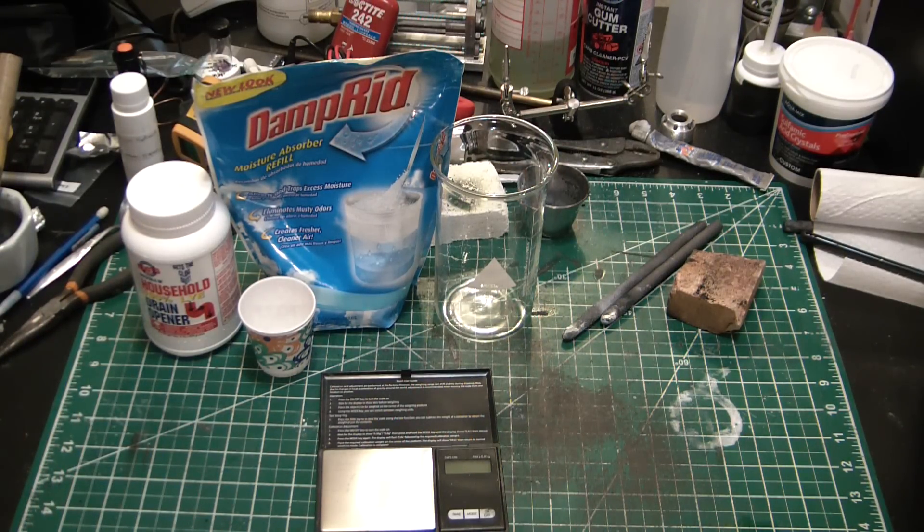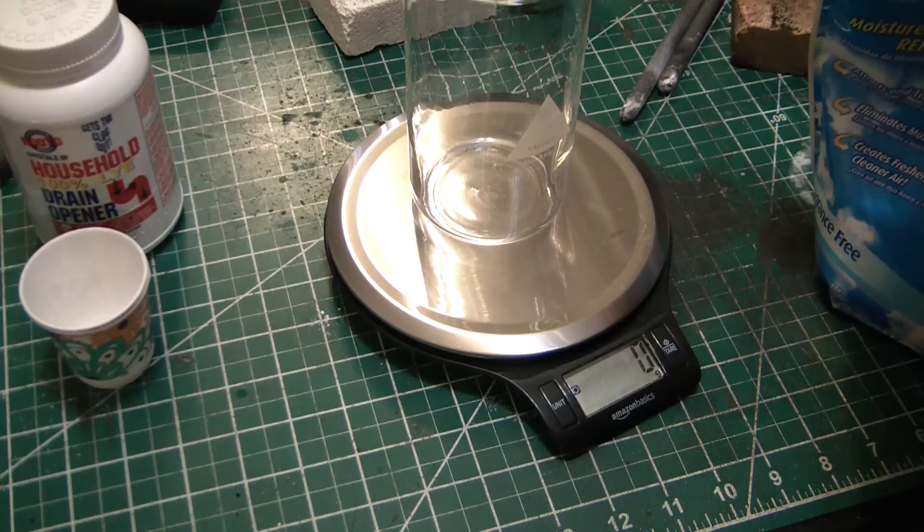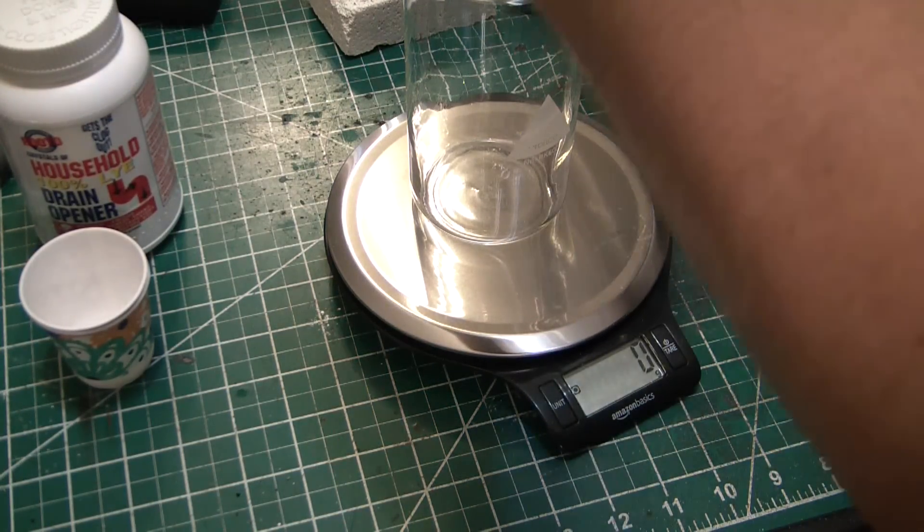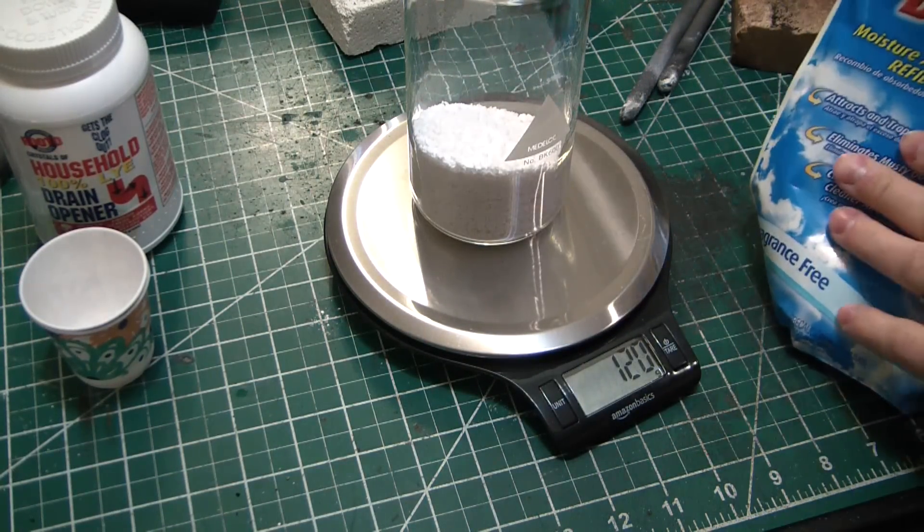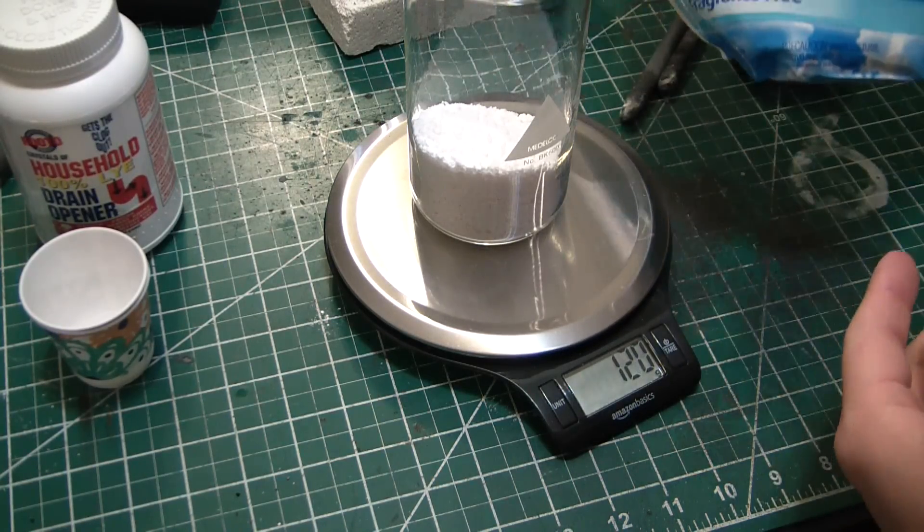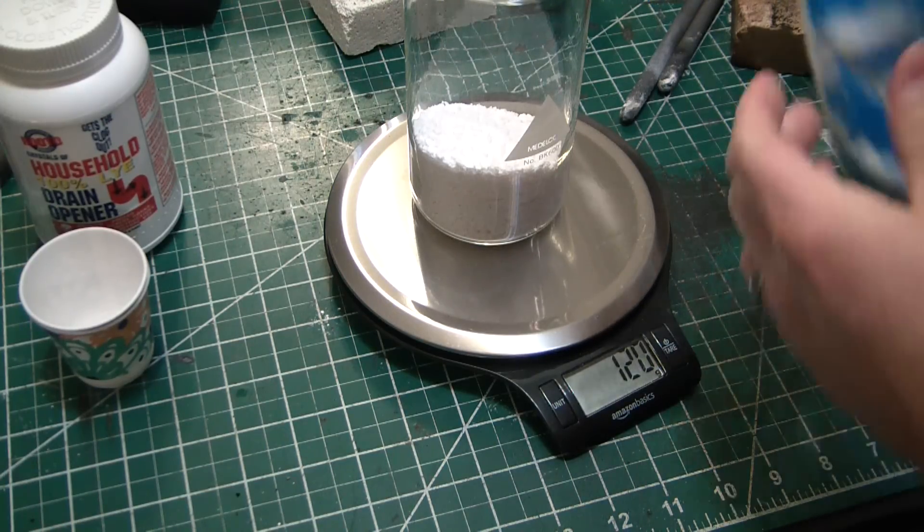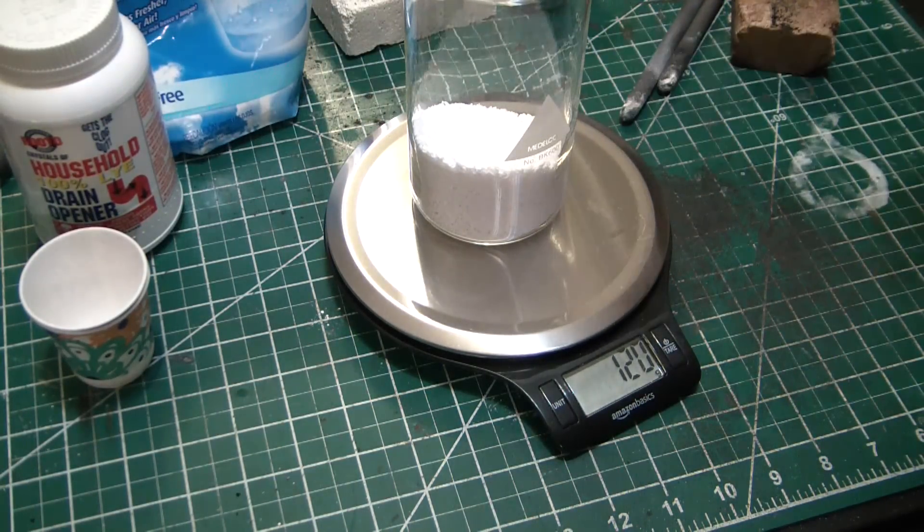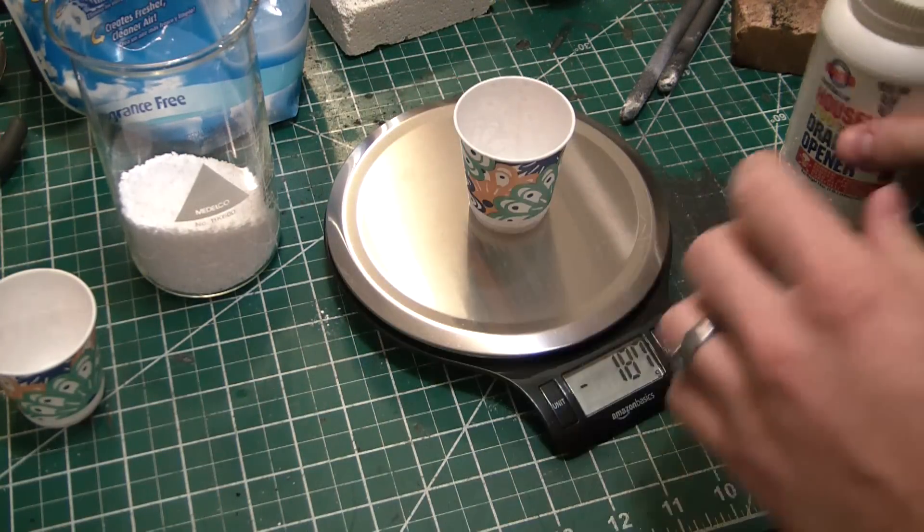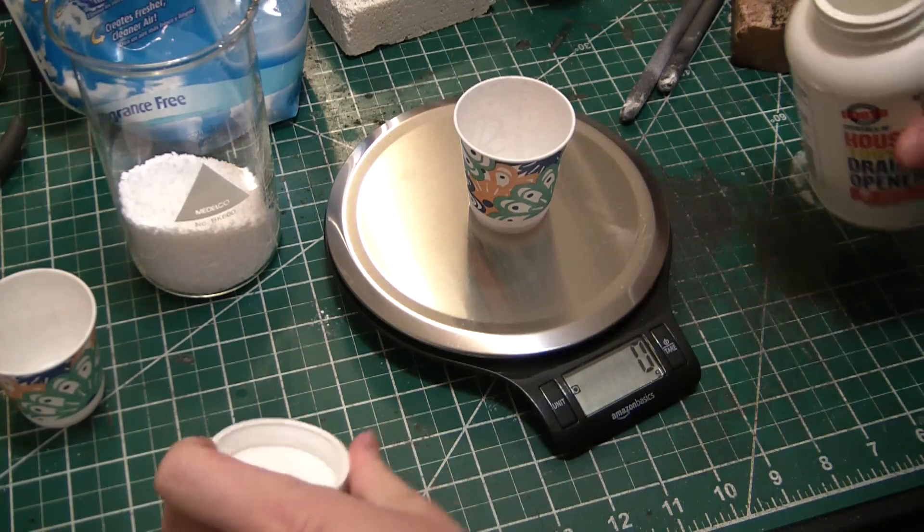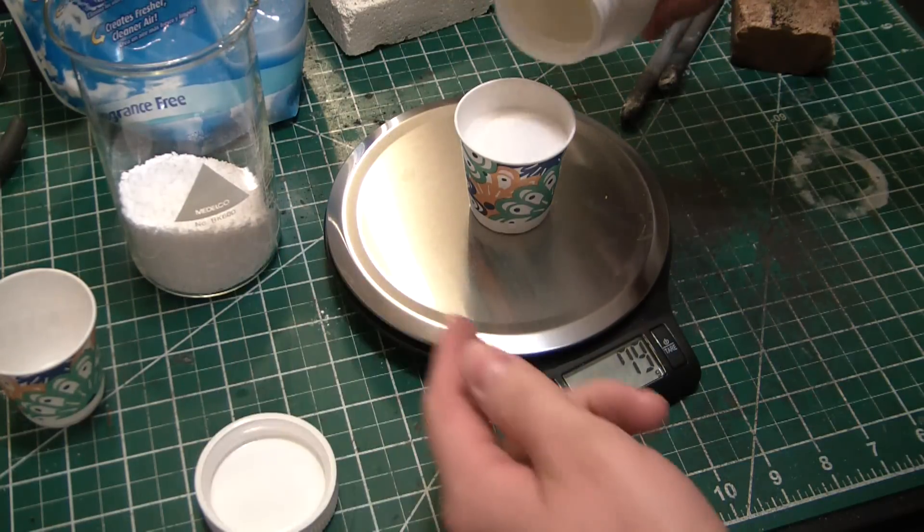So we'll tare that and measure 120 grams of calcium chloride. Now for my source, obviously I'm using DampRid, which is just calcium chloride marketed as a desiccant. It's pretty darn pure from the SDS sheets I've looked at, so I'm not too worried about using it. And then we'll measure out 80 grams of sodium hydroxide. Now at these ratios we will have a slight excess of calcium chloride. I'd rather have it that way than have any caustic leftovers.